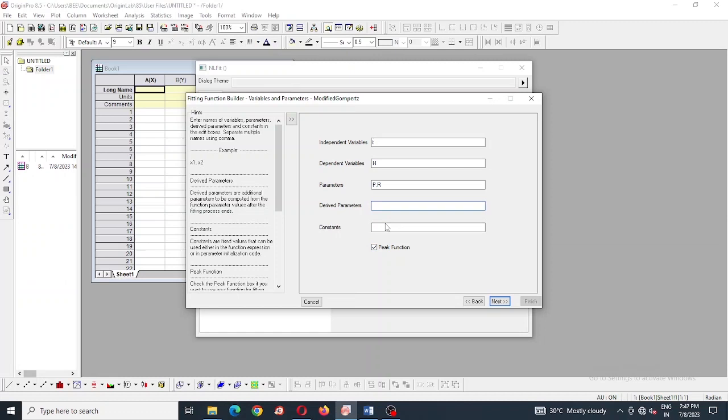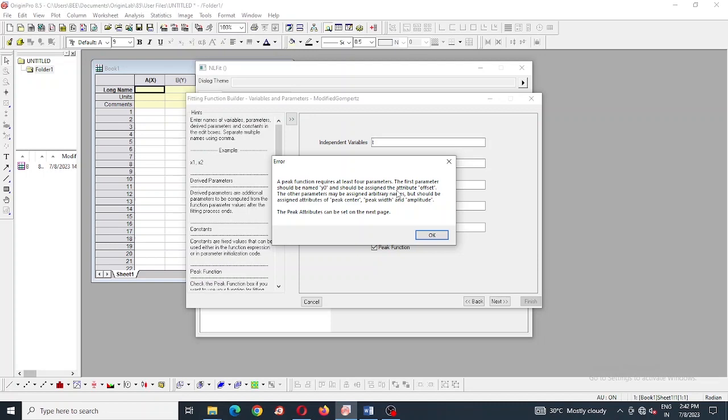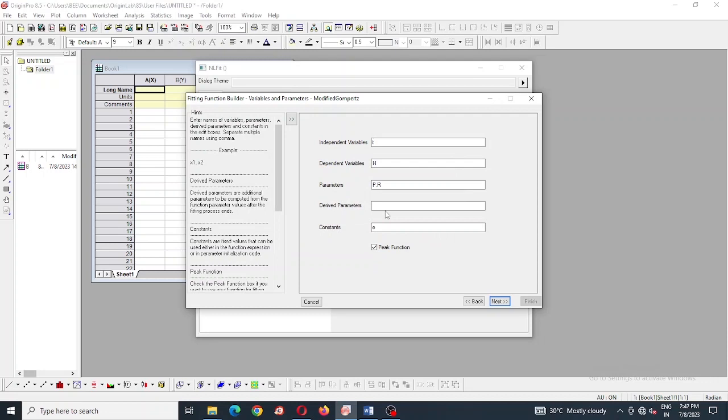Here constant is E. Lambda is not taking here, software is not taking lambda and that's why we are going to change this to X. At lambda space we are replacing with X.